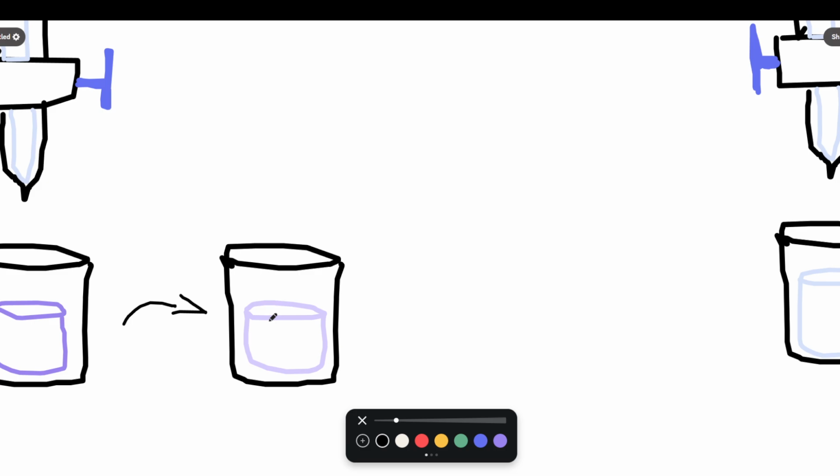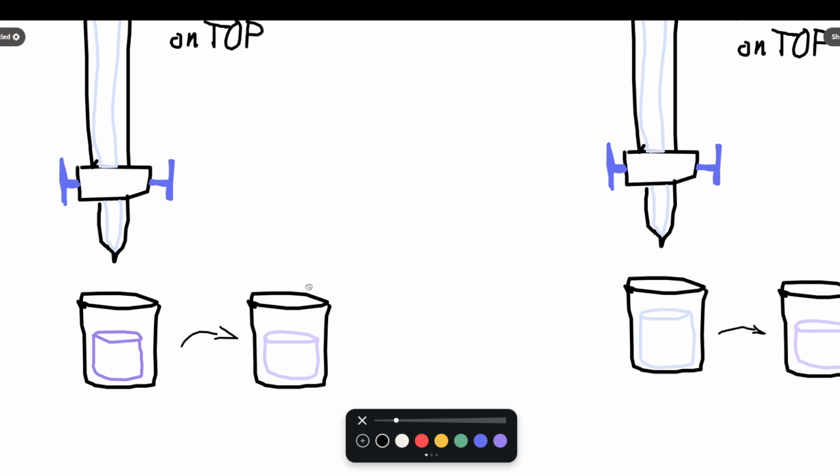No, my bad. You already have a little bit more base than the 50-50 ratio, which is fine. You can't really match it by color. This part is pretty qualitative.